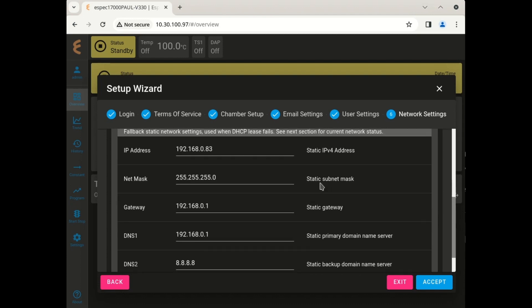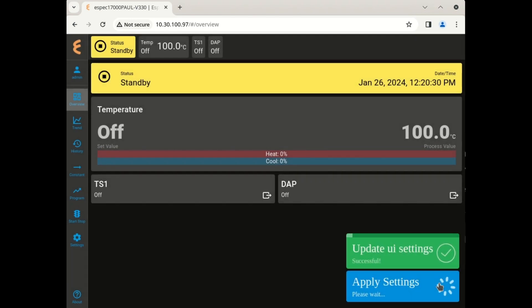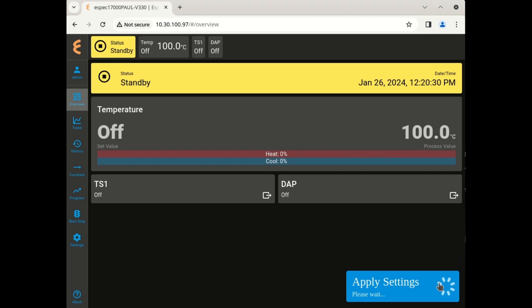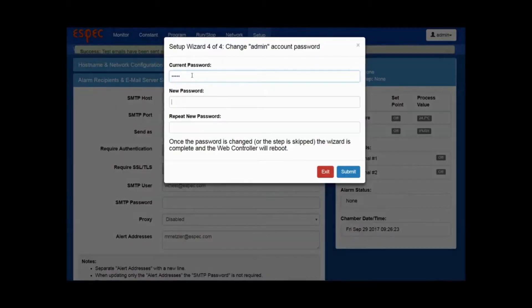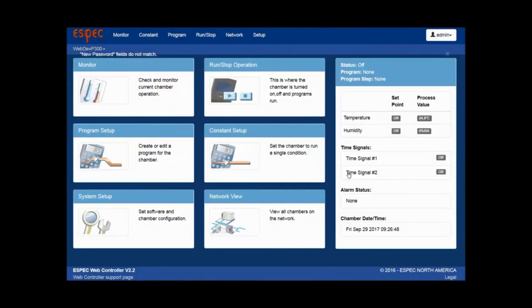Your web controller is now set up and ready for use on your computer. You can easily monitor the conditions, set up programs, and collect data for analysis, all from your PC. If you have any additional questions, please reference your chamber manuals or contact SBEC customer support.